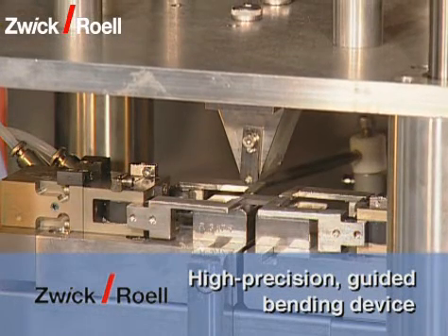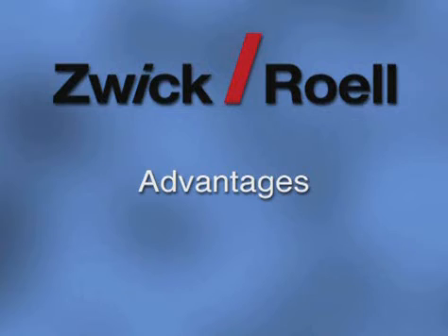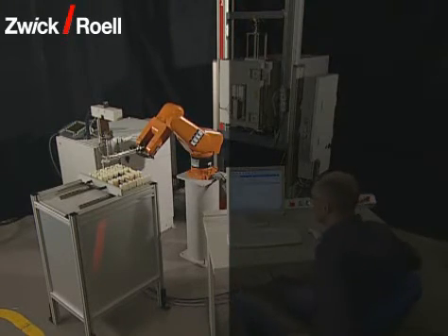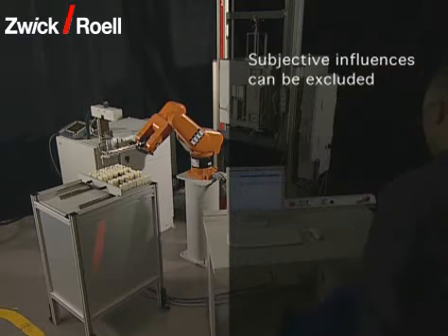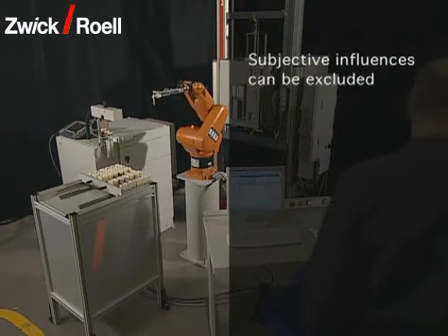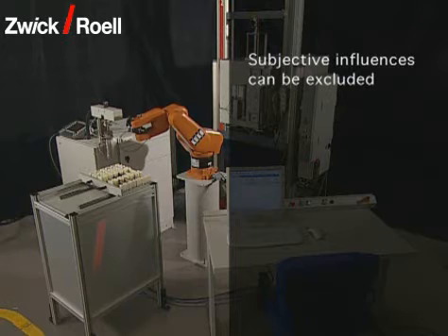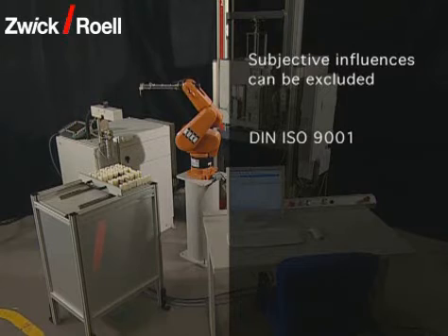The bending device is equipped with an additional high precision pillar guide. This guarantees the most extreme parallelism of the test arrangement and an axial load transmission. Due to the high repeatable accuracy of the automatic testing system, subjective influences are excluded. In the case of manual tests, these can have a negative influence on the quality of the test results, for example because of different users.